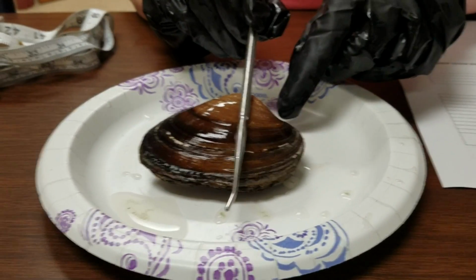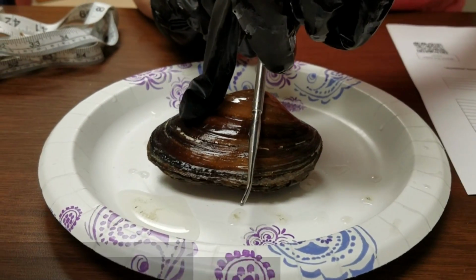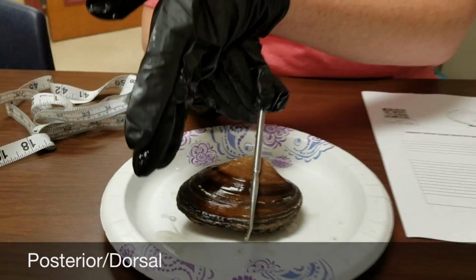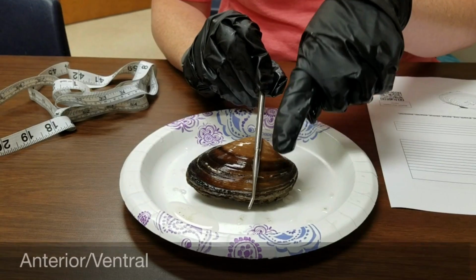Okay. With that, the larger side is going to be your posterior or your dorsal side. Okay? So the larger side is your posterior or dorsal side. The smaller side is going to be your anterior or your ventral side.